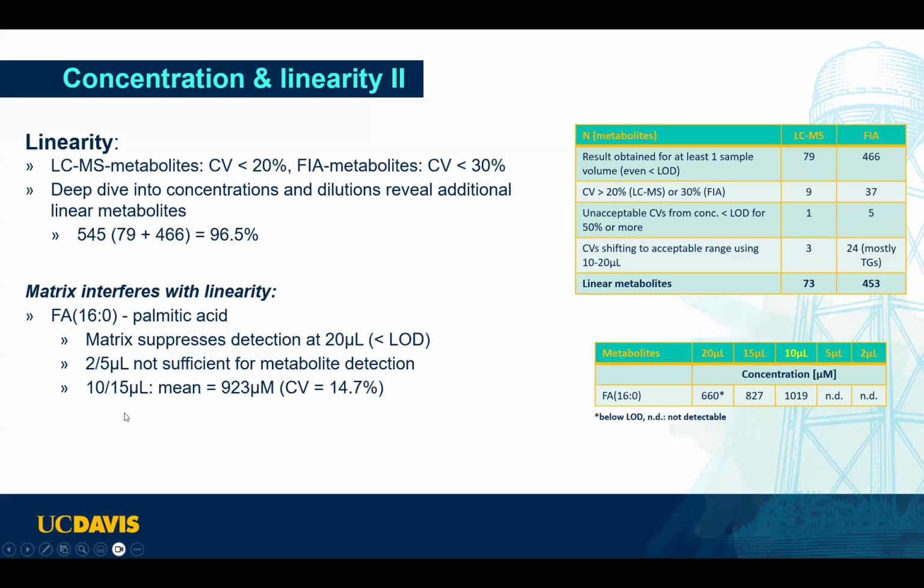But you have to consider we only looked at 2 of the used sample volumes here. So I would like a little more data around this to see whether or not this is a trend. But it certainly shows you nicely how the matrix can interfere with your detection.